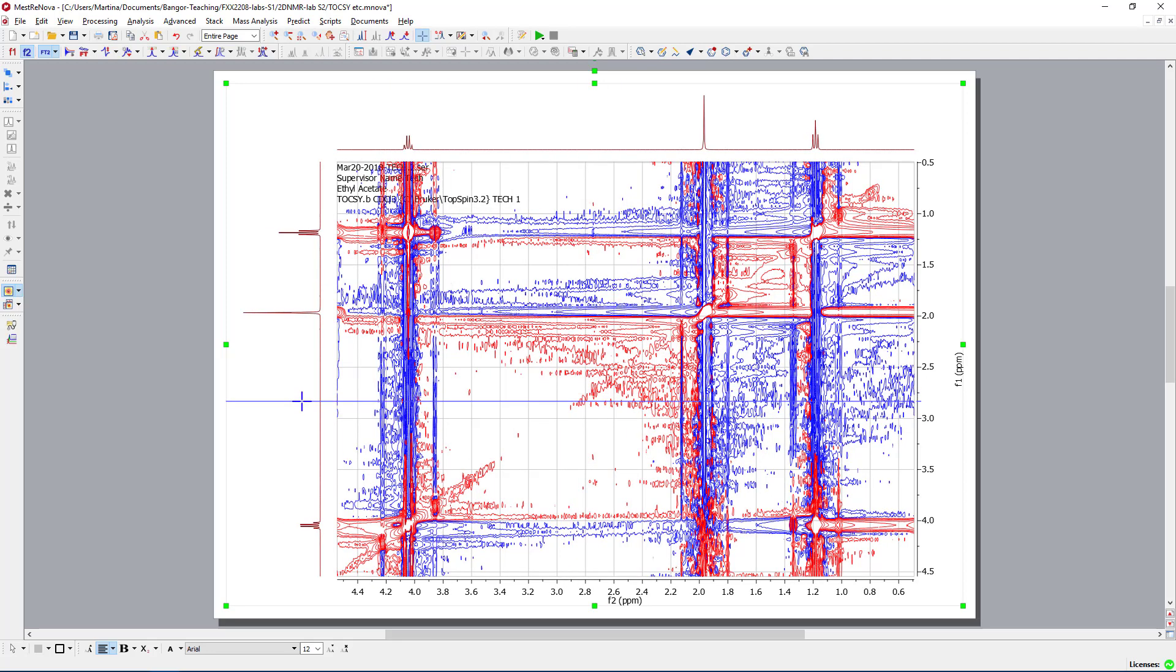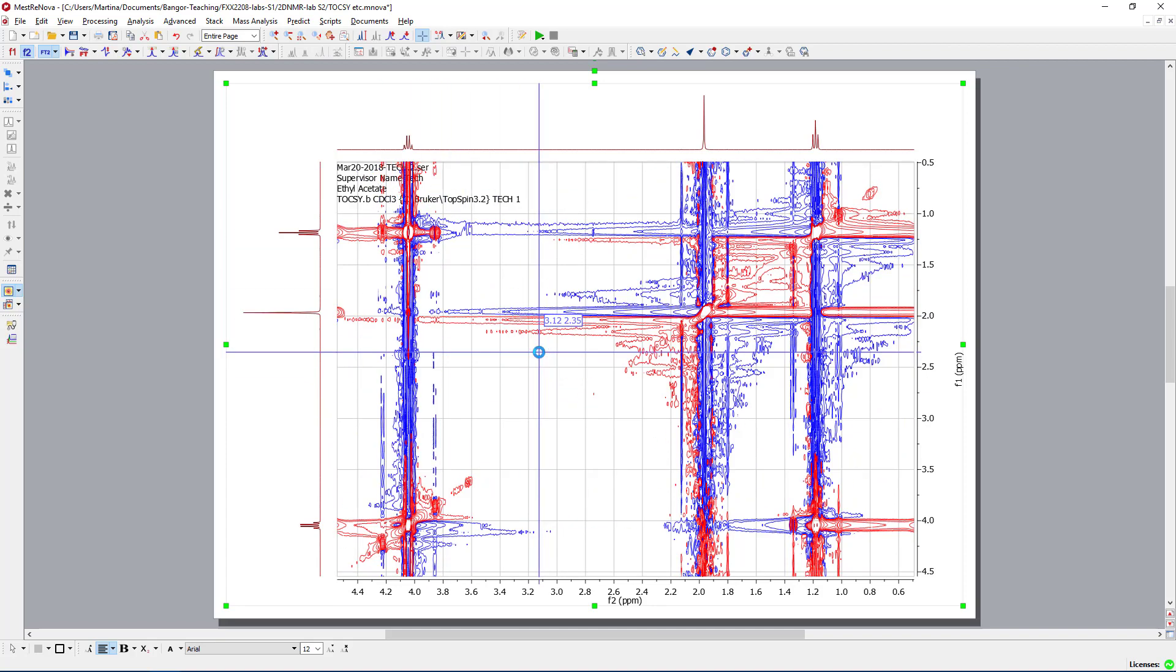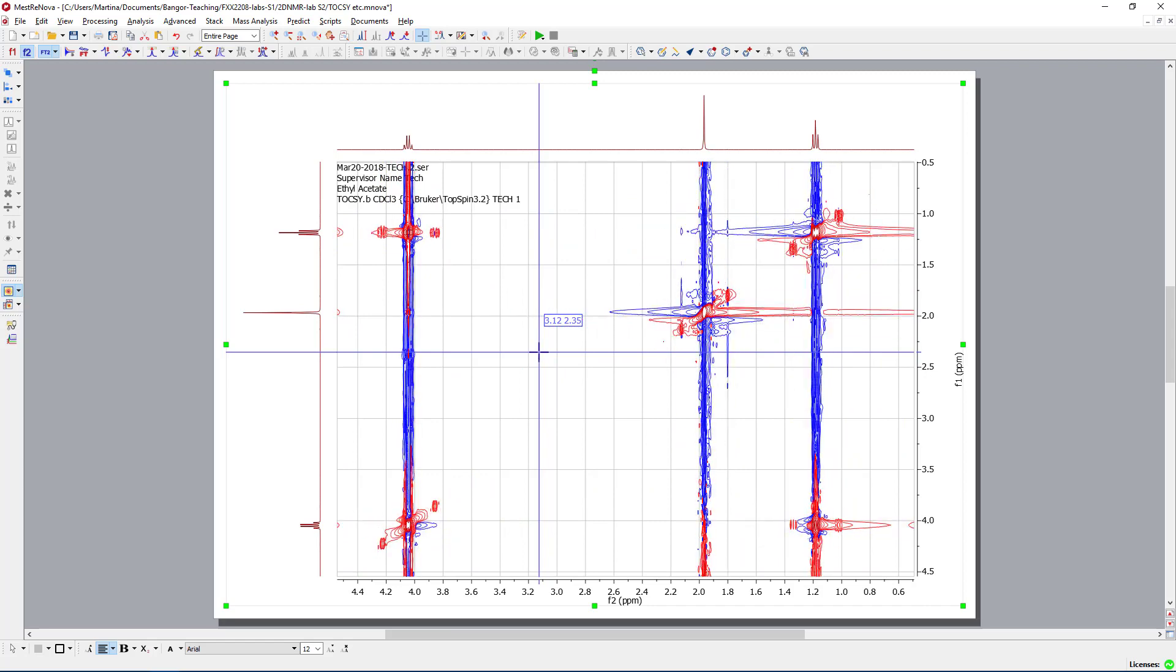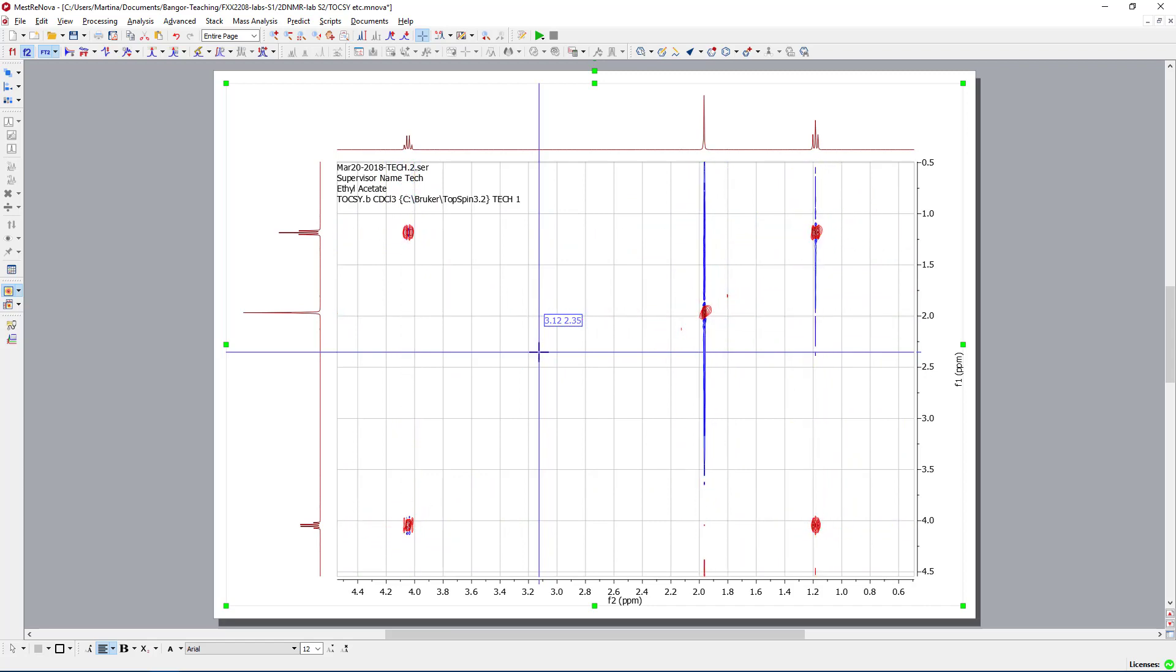Often when you open up a TOCSY, you won't see any traces at all. But now, we have at least the correct ones. So, again, we have to scroll it down so that we can get the correct depth. And now, we are basically at the same spectrum as we could see for the COSY for ethyl acetate.